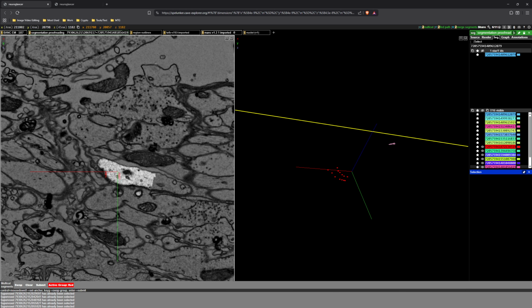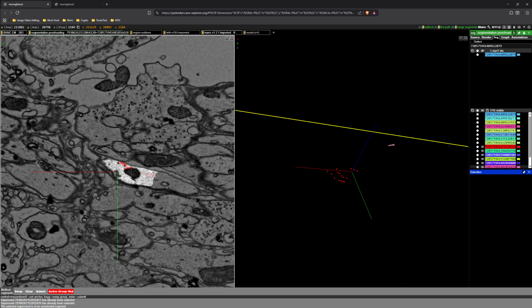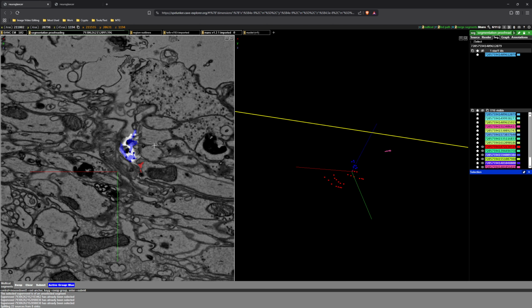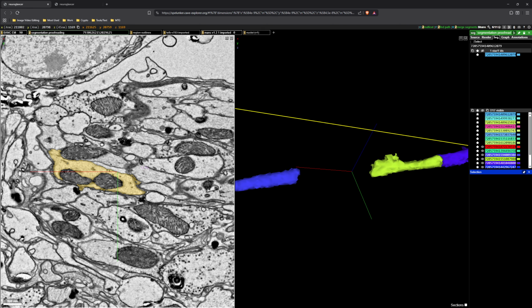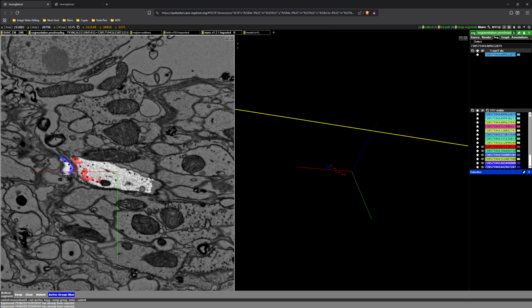very particular annotation placing, but of the flood method. Oh, wow. The speed of that split was quite nice. Might as well clear this one up too.